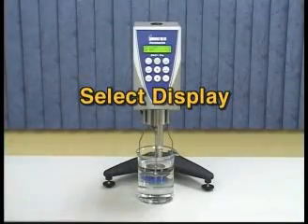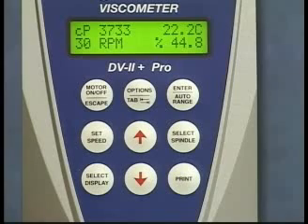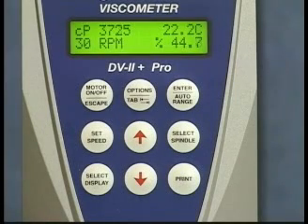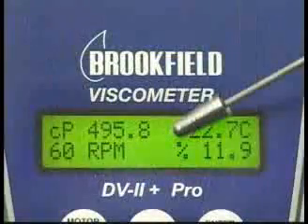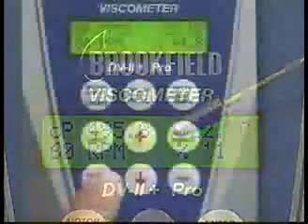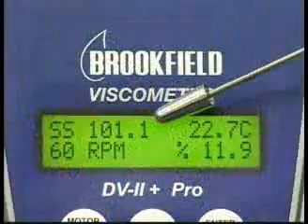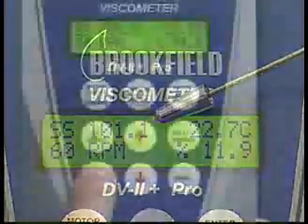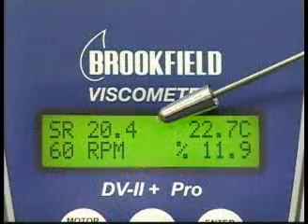Select display. The select display key allows you to choose which data parameters you want shown on the main display. You can choose to display viscosity in centipoise shown as CP, shear stress in dynes per centimeter squared, or shear rate in reciprocal seconds.